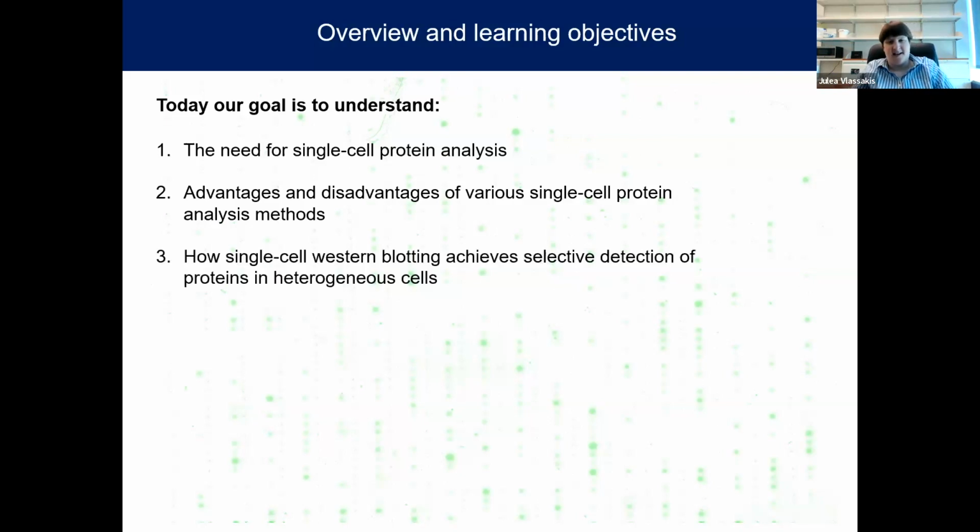Since my expertise is especially in the single cell Western blotting family of single cell proteomic assays, I'll talk a little bit about the fundamentals of that assay and how it promotes selective detection of proteins in heterogeneous cell populations. And I'll wrap up this section of the panel with some current challenges and opportunities in the field of targeted single cell proteomics.